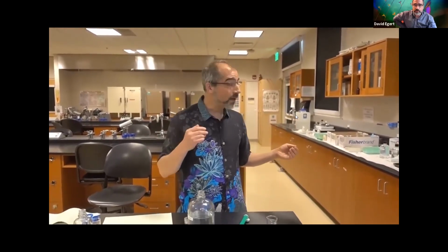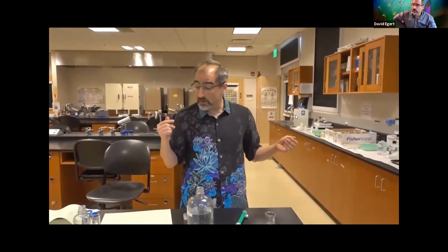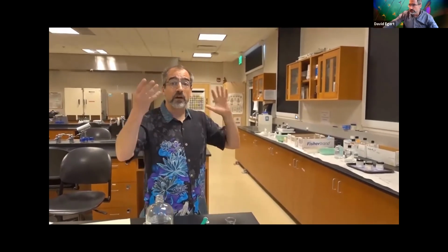So in your discussion, parts 2 and 3, even though they're separate parts, you should integrate your observations for both the electrolytes and carbohydrates under the same conditions and how they are similar and how they're different and why that makes sense. The last part of the carbohydrate part is just looking at the optical difference.